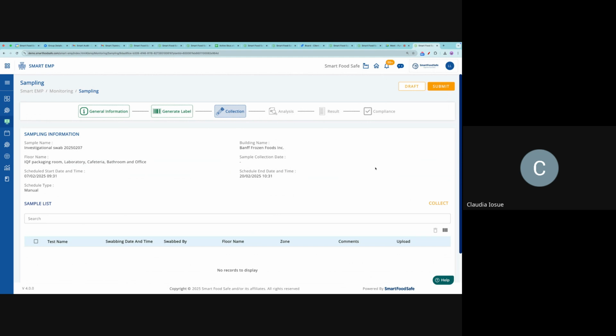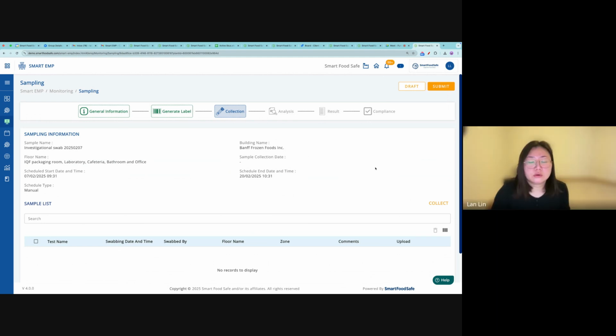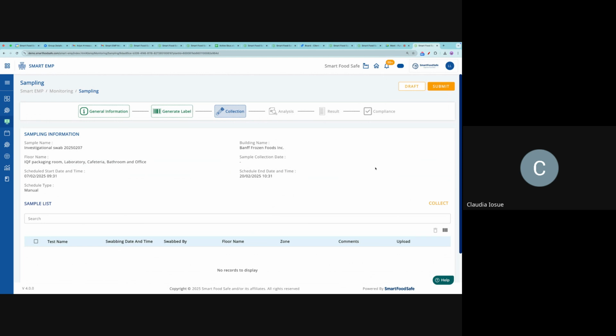Stephanie has a question. She sent me via inbox. She's asking if a company can upload the results from any surface or food analysis they do, so the heat map can be generated automatically. Food, no. This is only for surfaces. But can they upload it so the heat map is auto-generated? No, we will have to upload it manually in this case.